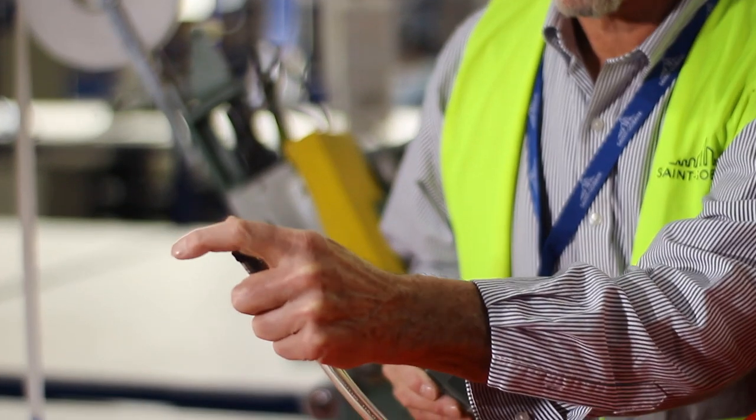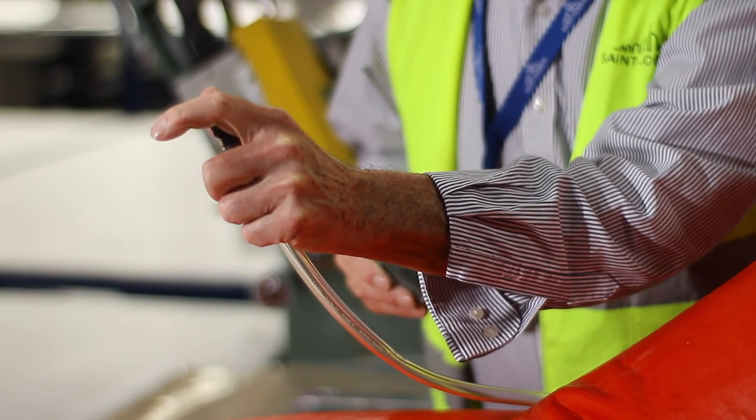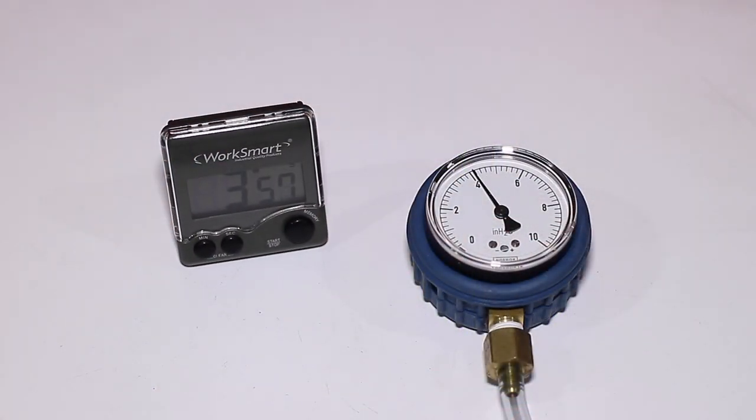After 1 minute at 5 inches H2O, reduce the pressure down to 4 inches H2O and hold for 4 minutes. Be careful not to touch or disturb the suit during the test period, as this could create false results.